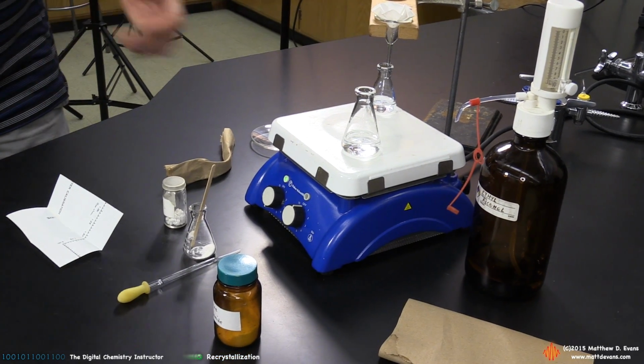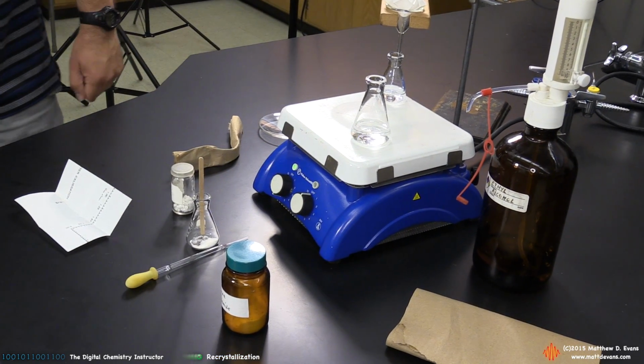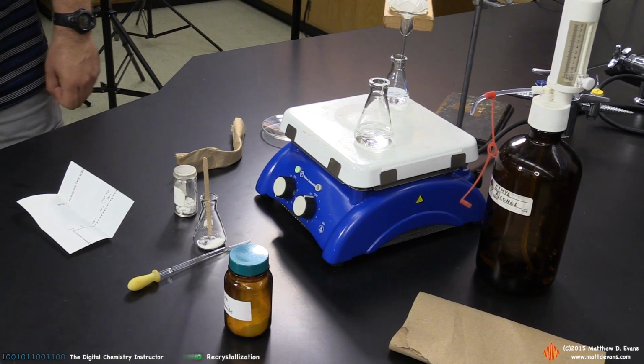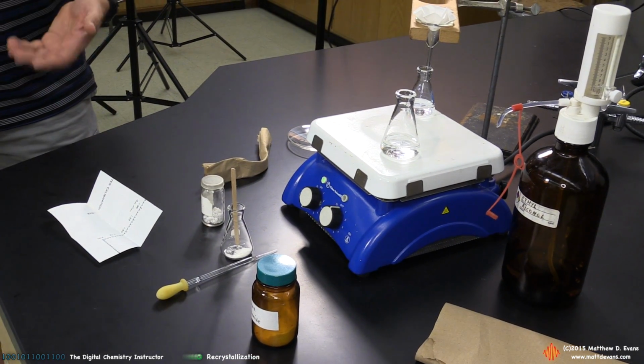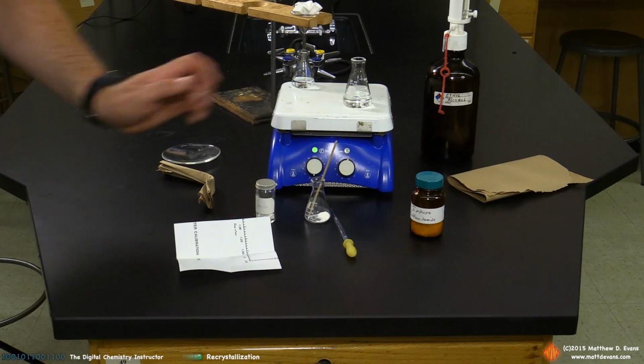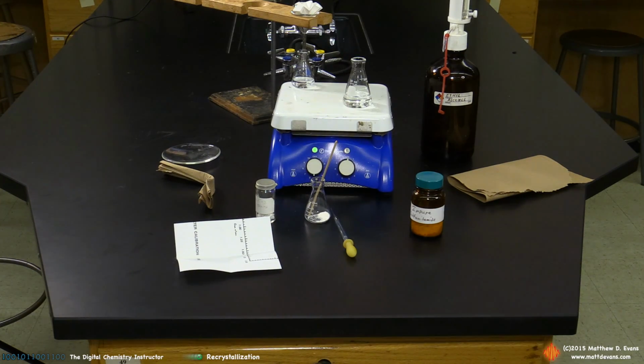But the idea here is this is impure. By recrystallization, we're hoping to purify this compound, and by the time we measure the melting point, which is our data to prove that we've purified this, we're hoping to get a good melting point out of this. All right, so right now I just got to wait for this solvent to boil, then we're going to get started on this recrystallization. Okay, I see that my solvent is just boiling in the solvent reservoir.